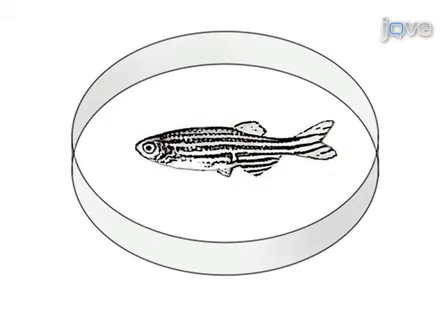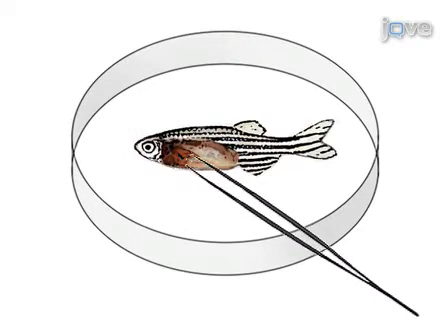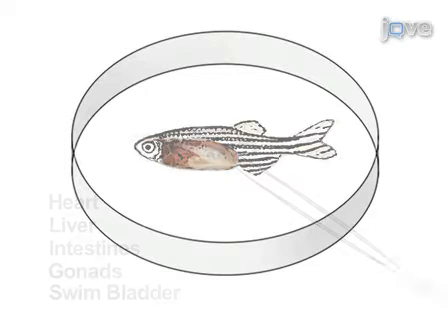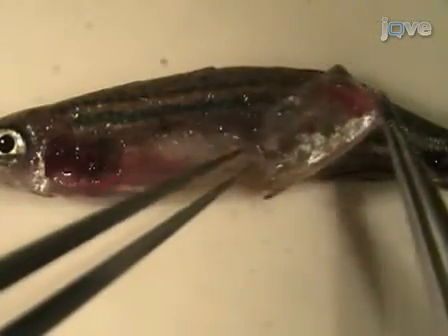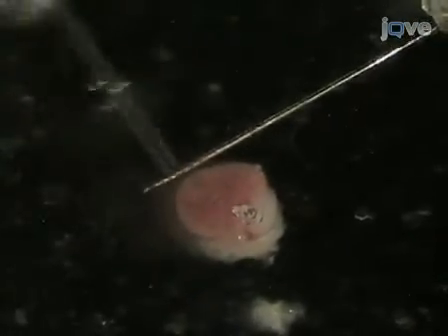To begin, a fish is anesthetized and euthanized and then pinned to a dissecting mat. The skin and underlying muscle are removed from the fish to expose the heart, liver, intestine, gonad, and swim bladder. The internal organs are removed from the body cavity for further examination or experimentation. Tripti Gupta from the Laboratory of Mary Mullins in the Cell and Developmental Biology Department at the University of Pennsylvania will identify many of the organs of the adult and demonstrate how to dissect them from an adult zebrafish.